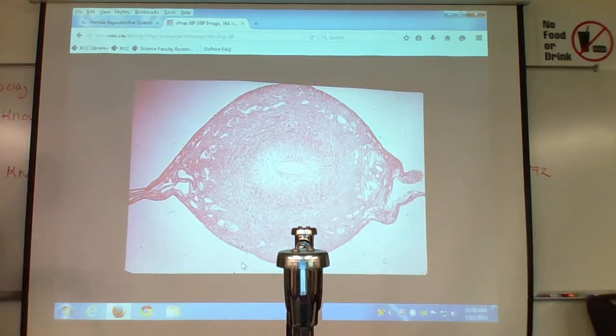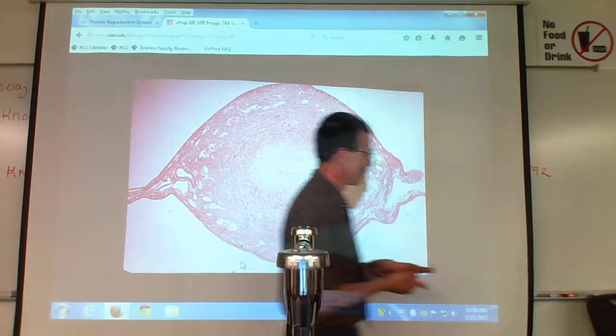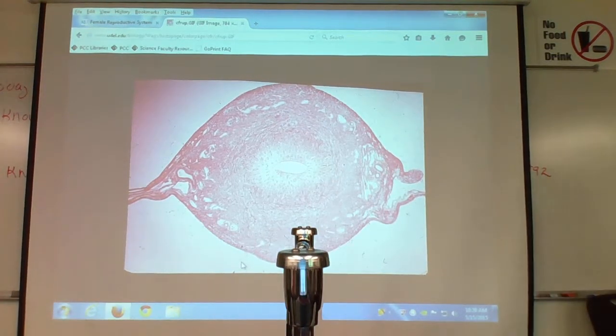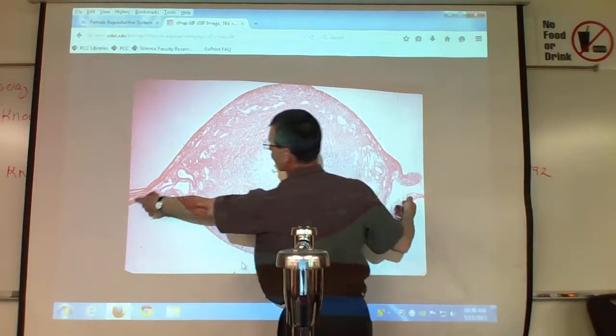So this is your uterus just chilling in there? Yep. There's no baby in there yet. Are those fallopian tubes or ligament? Maybe. These would be the fallopian tubes here and here, I think.